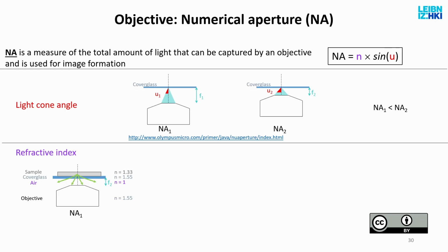So if you can focus closer, you increase the angle and you increase the NA. Okay? I'm sorry, I didn't clarify that. My objective from now on, I mean objective lens. That is not one lens, it's an array of lenses like you saw in the slide, that is used by the microscope to form the image. So I mean objective lens. So what can I do about this?